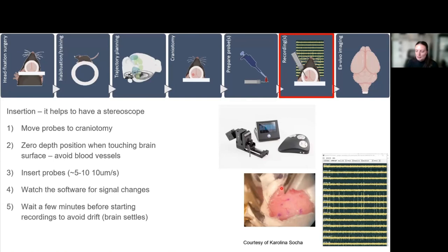You first zero the depth when you touch the probe. Please avoid any blood vessels because it's just better to avoid them. Once you can go in, you just insert the probes very slowly at a speed from 5 to 10 micrometers per second. You can know that you're in the brain by watching the signal. In this case, we use Spike GLX software, and you can just see that at some point the signal changes and you see spikes appearing, and that's how you know you're in the brain. If you're deep enough based on your trajectory planner, you have to wait a few minutes before starting the recording to allow the brain to settle.